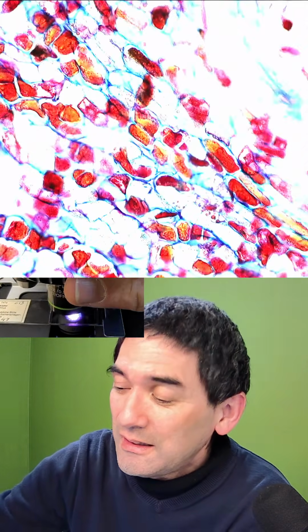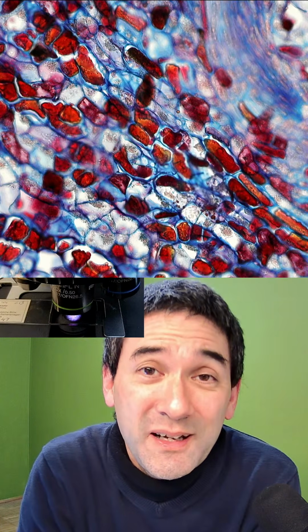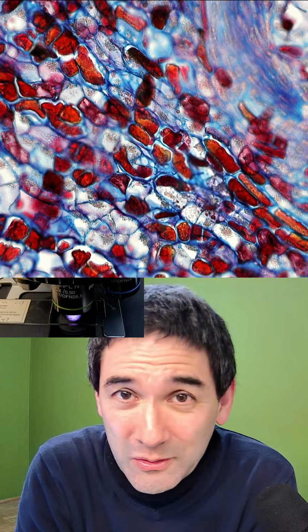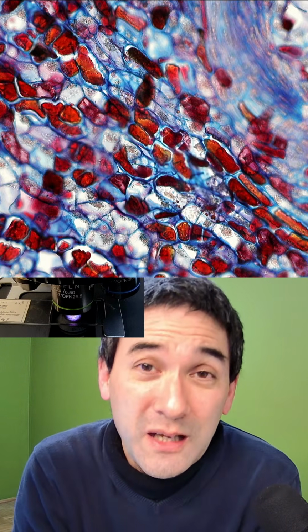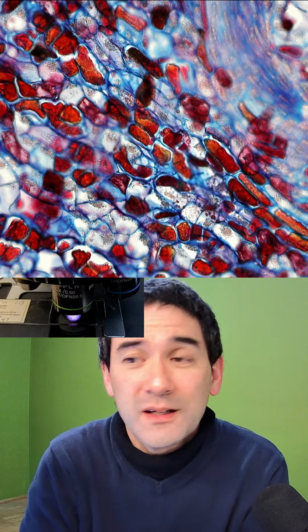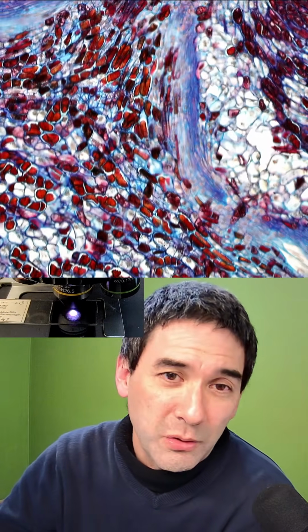These days, luckily, it's easier than ever before to do microscopy as a hobby because the microscopes are easily accessible and also affordable. I mean, this used not to be the case. I remember when I was still, I don't know, 30 years ago, just finished university, I wanted to get myself a microscope, but they were expensive and not quite as readily available. So for this reason, these days it's significantly easier to simply start it.